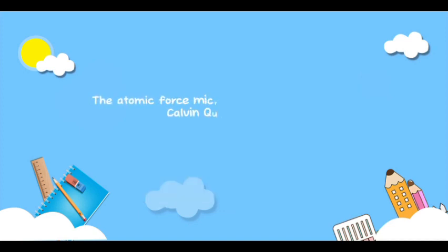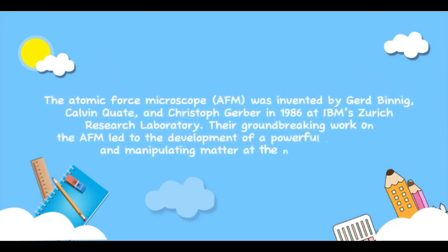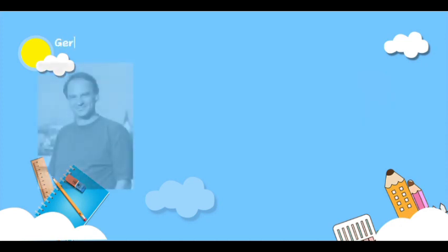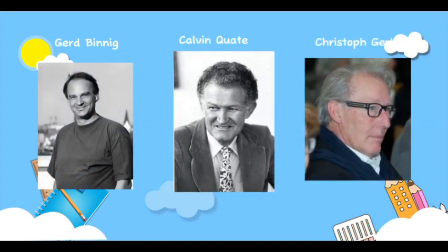The atomic force microscope, or AFM, was invented by Gerd Binnig, Calvin Quate, and Christoph Gerber in 1986 at IBM's Zurich Research Laboratory. Their groundbreaking work on the AFM led to the development of a powerful tool for imaging and manipulating matter at the nanometer scale.